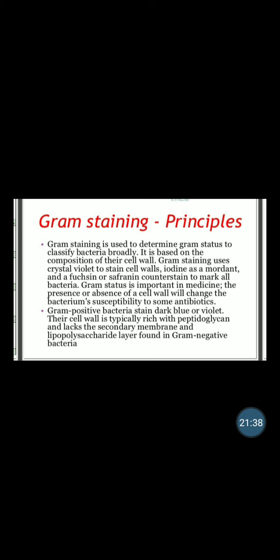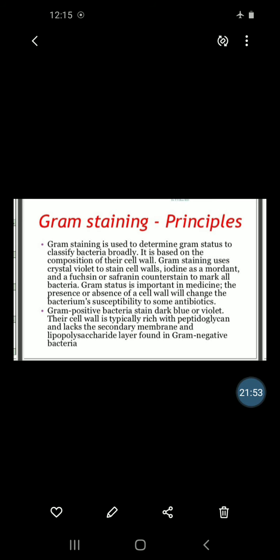Keep in mind, the Gram status is important in medicine. Why is it important? The presence or absence of a cell wall will change the bacterium's susceptibility to some antibiotics. The Gram positive bacteria stain dark blue or violet.